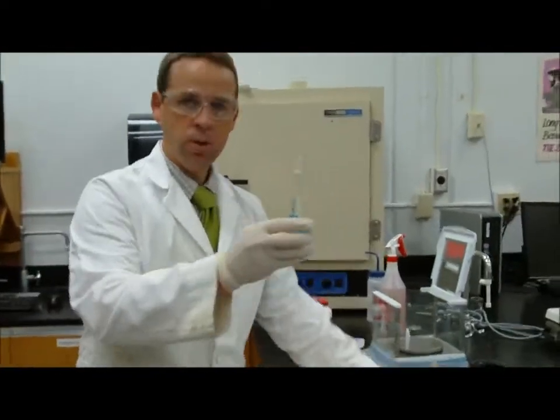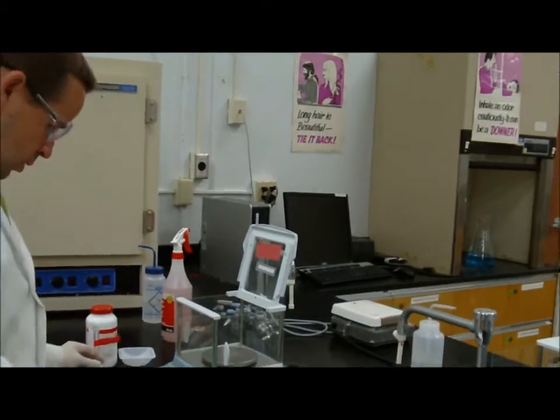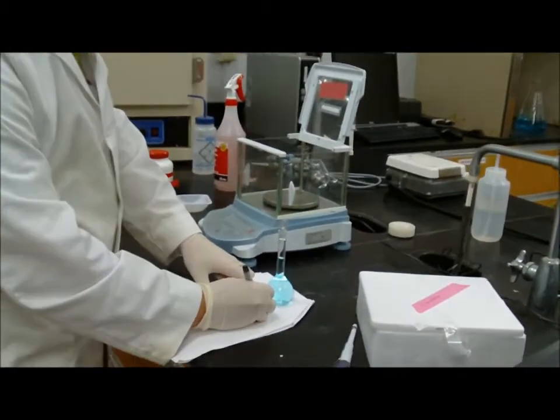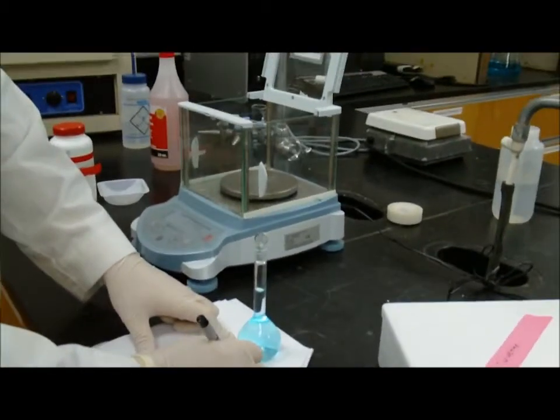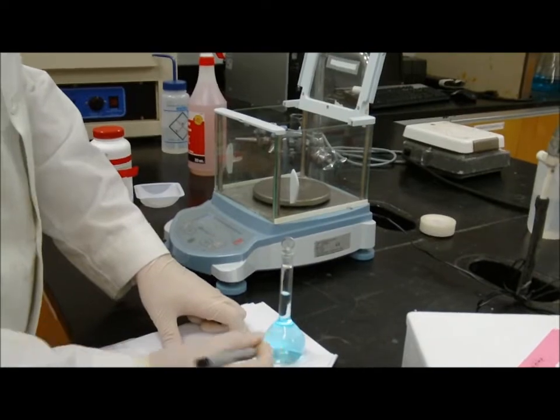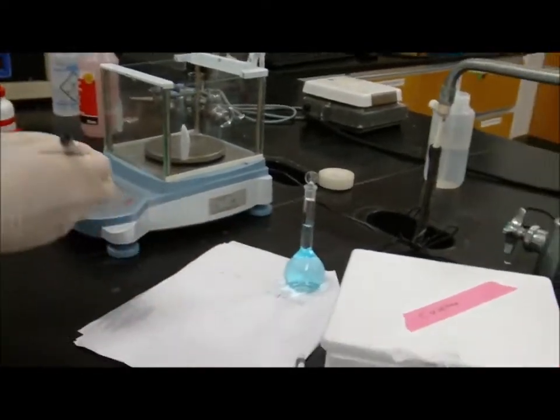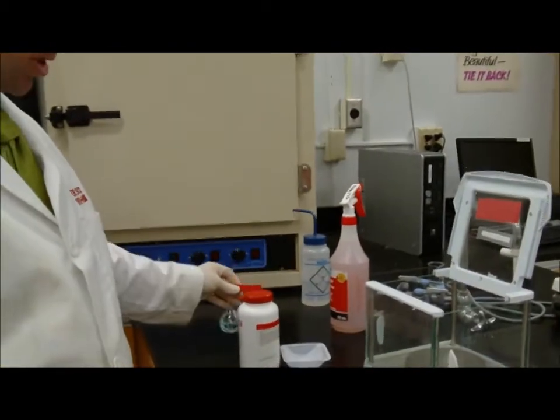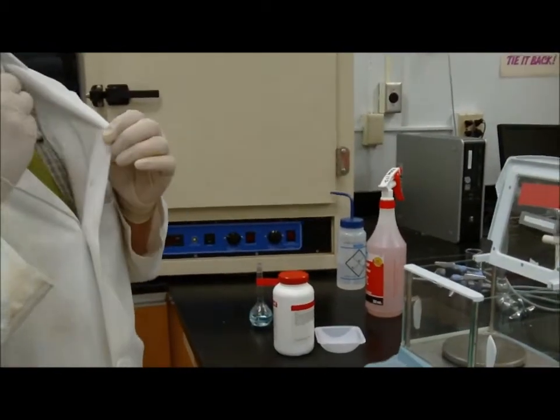Okay, so this is my known solution. I know the concentration of this one. It is 0.05 molar copper sulfate. All right, so there's my 0.05 molar copper sulfate. This is my unknown over here, and I'm trying to determine how much copper sulfate is in that solution.